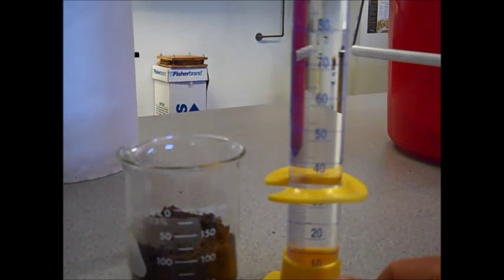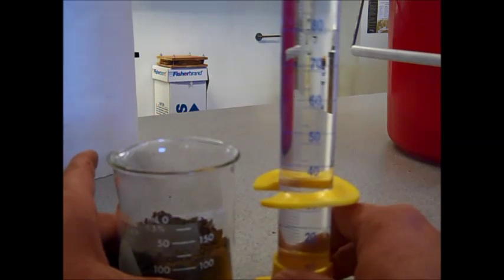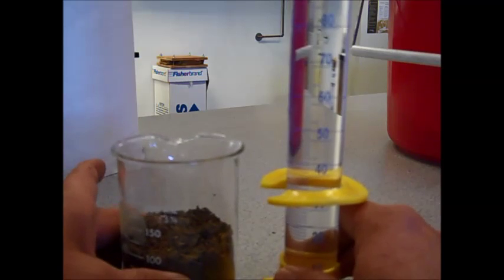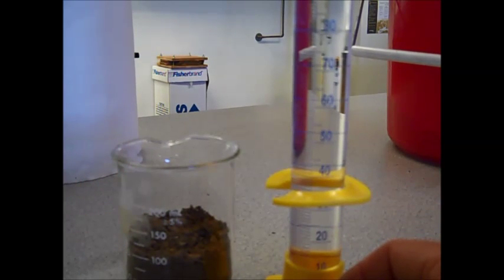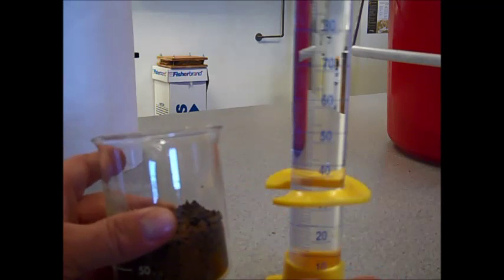If you are close to the Chino campus or have other classes in the Chino campus, these two measuring devices will be in the back of the greenhouse. And if you are near the Verde, you can use these as well. However, these are not necessary. You can use tablespoons, teaspoons, ounces, any device you have for measuring. All you're determining is how much water fills the available pore space here, and then you do a calculation.